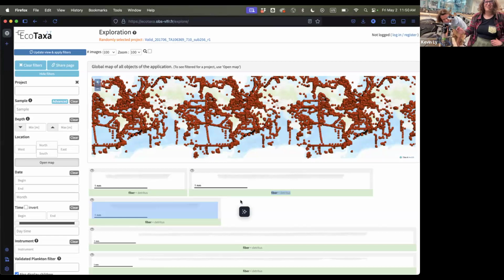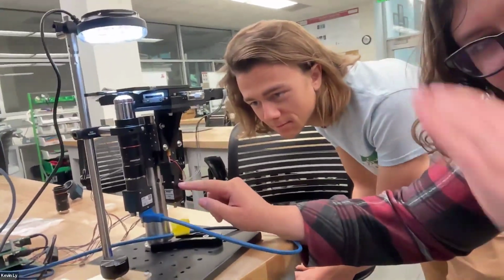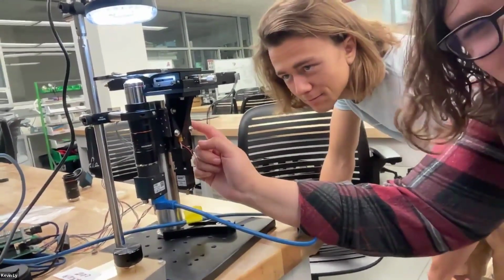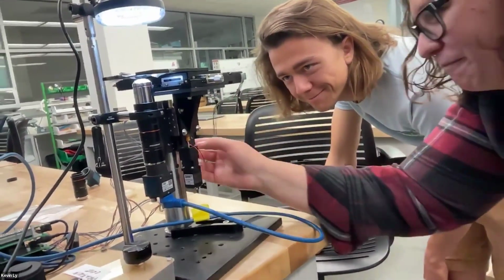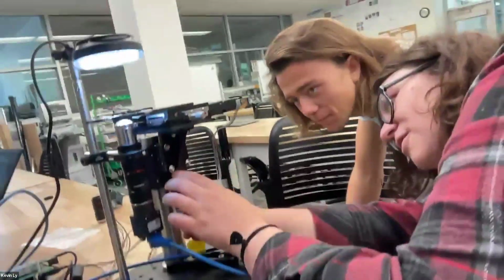Usually the construction of this is where you have the optical chain. So this is the objective with mirrors, and the camera is attached to this Z stage. This is what makes the objective move up and down to focus. But it looks like this was attached to this piece, which is bolted in, so it's not free to move up and down as far as I can tell.